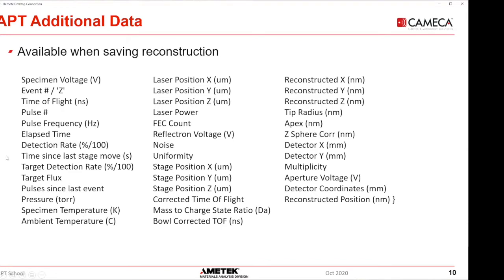For instance, laser positions, various corrections for reconstruction, detector coordinates, multiplicity, all that good stuff. Detector coordinates X, Y. I think it pretty much has everything that people want.